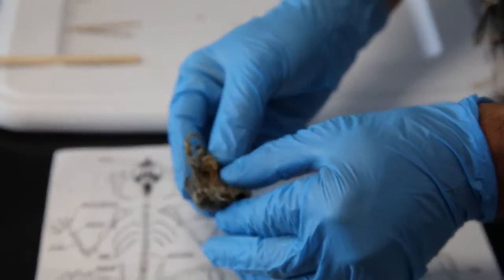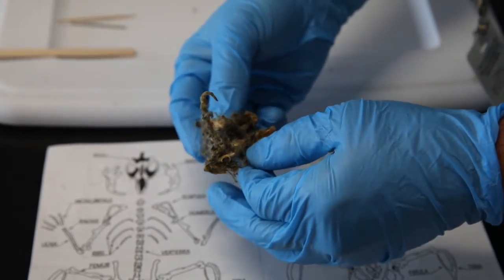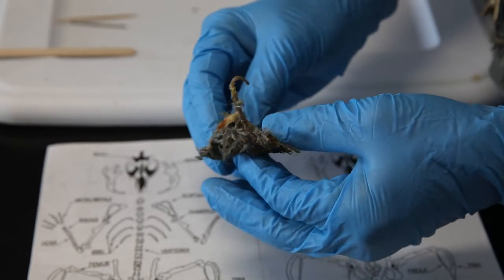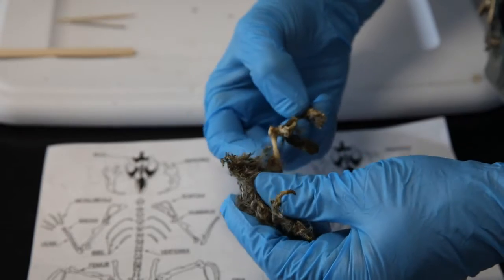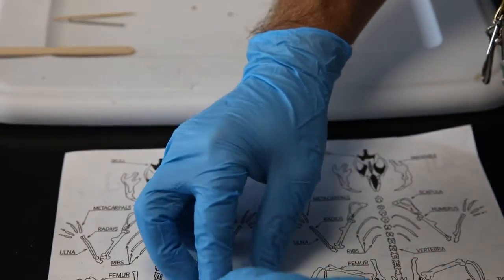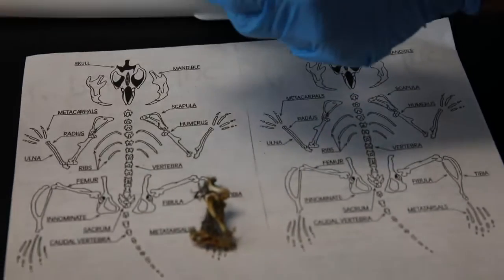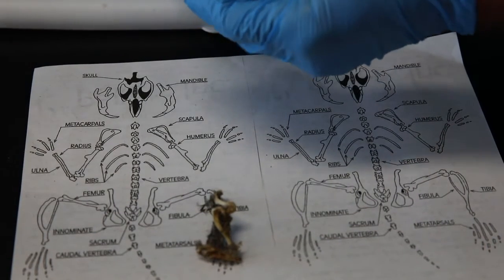Oh, I see a foot. That's gross. Dave, you're enjoying this. This is really gross. There's a foot. So this owl didn't digest everything too well, did he? And I place on the paper what I got here. I see a foot and a... All right. Is it lunchtime yet? This is like a Buffalo Wild Wing right here. There you go. Yeah, Dave's getting hungry, so we better hurry along here. This is really weird.